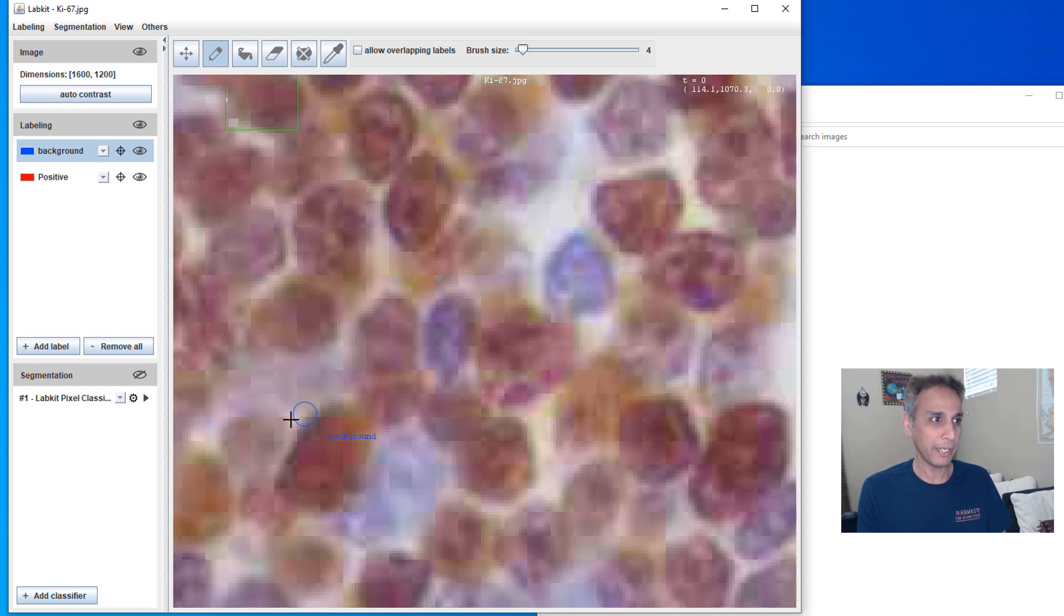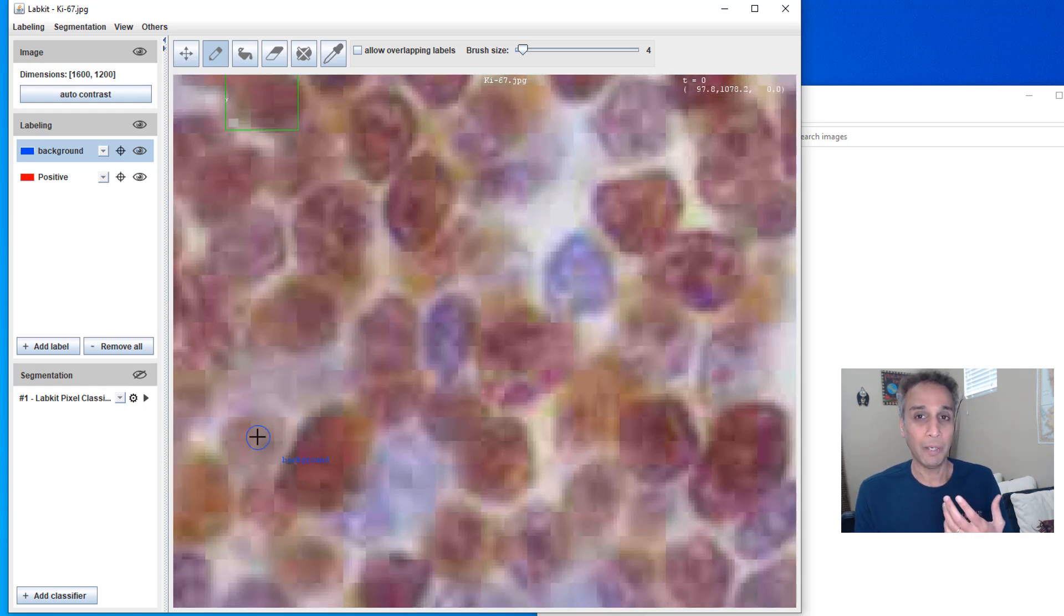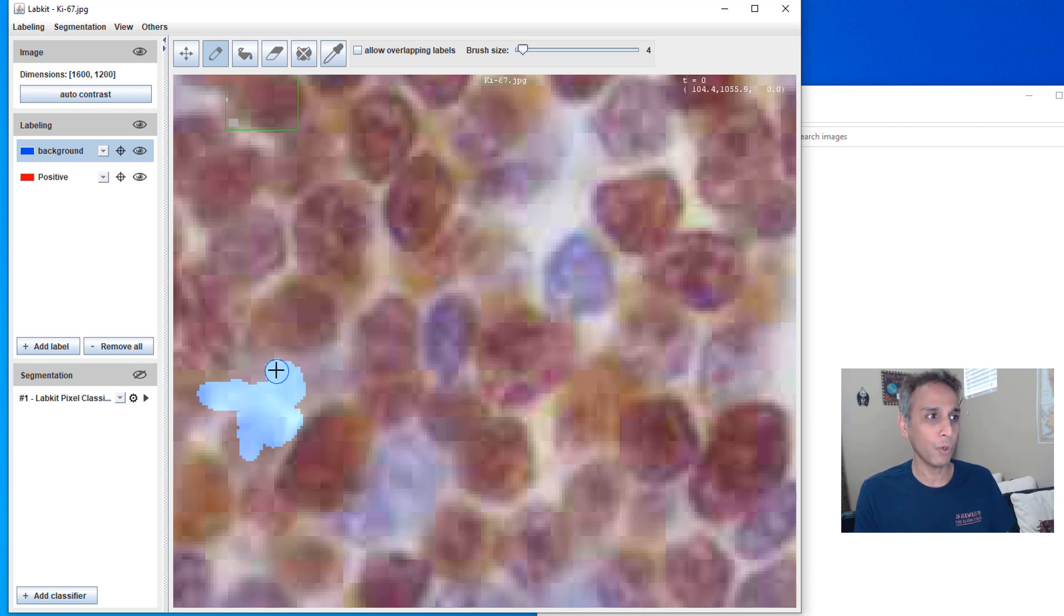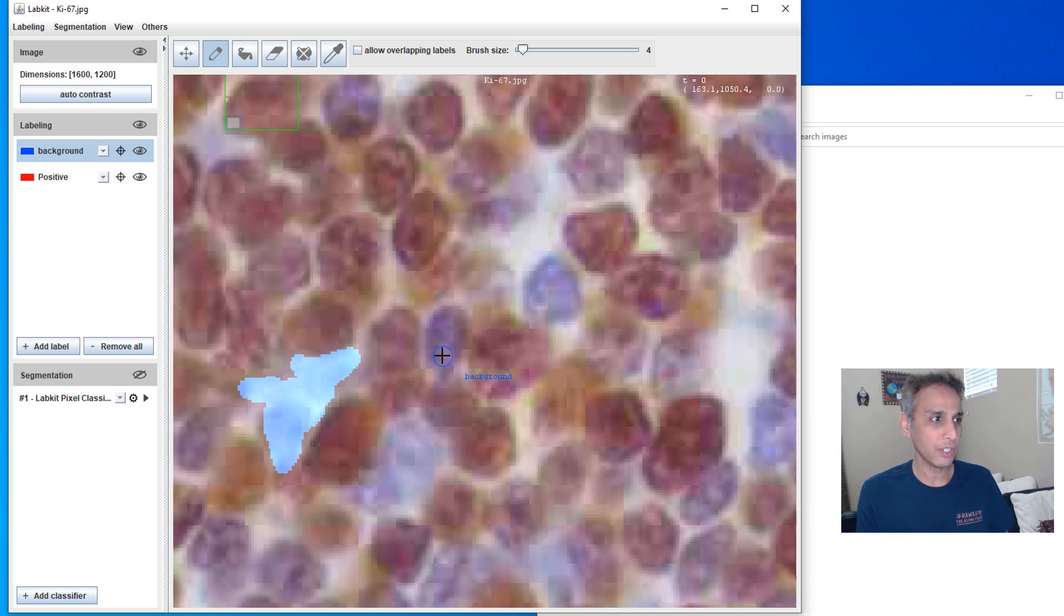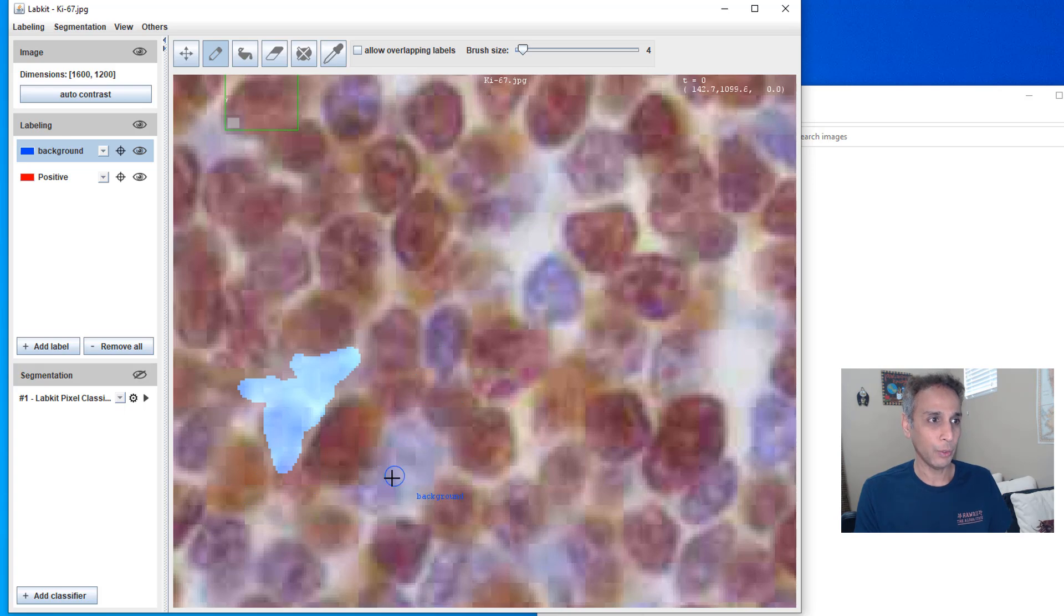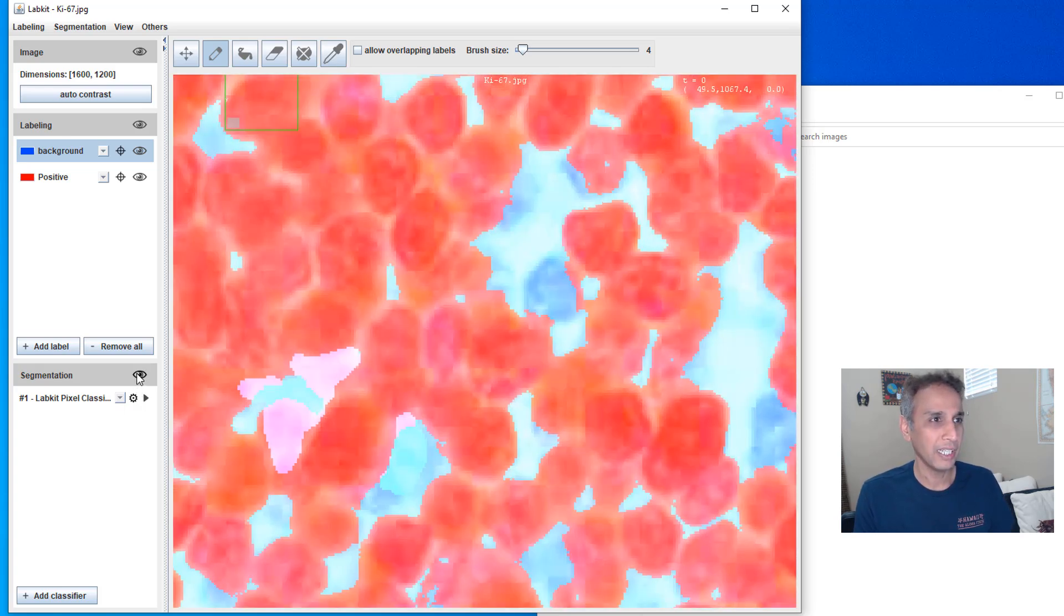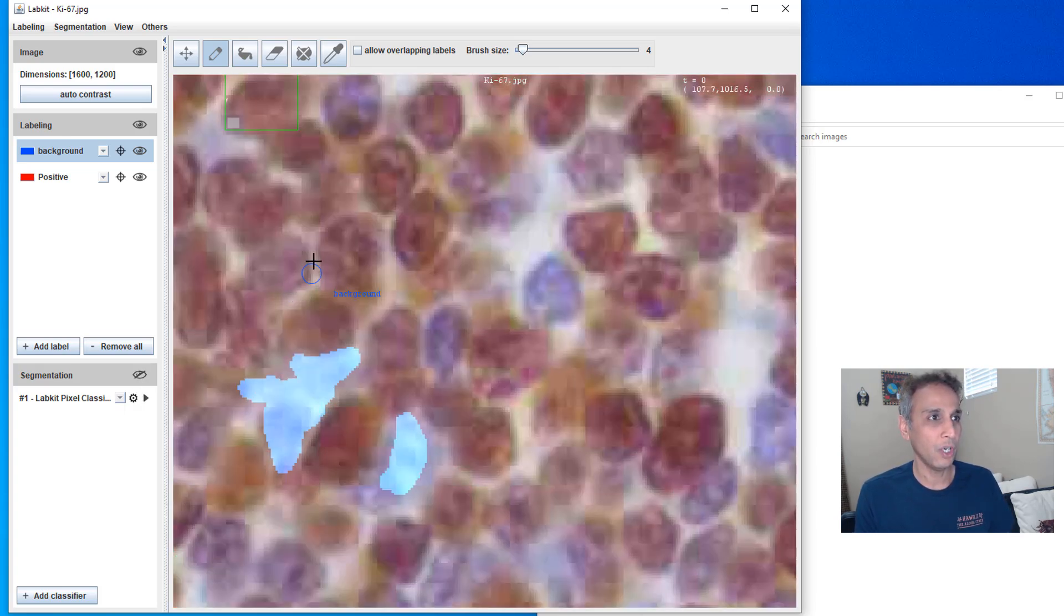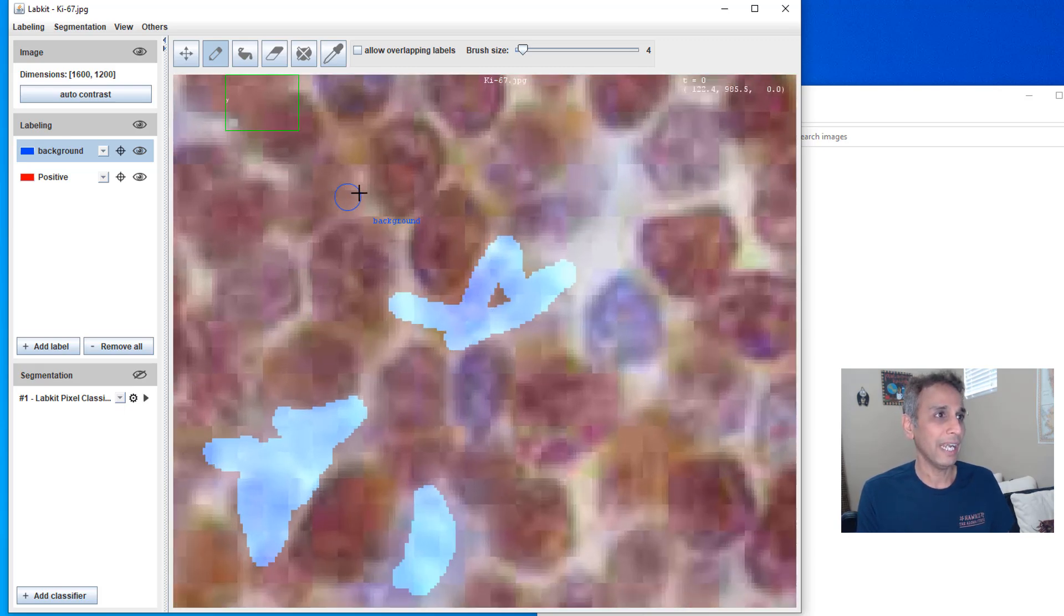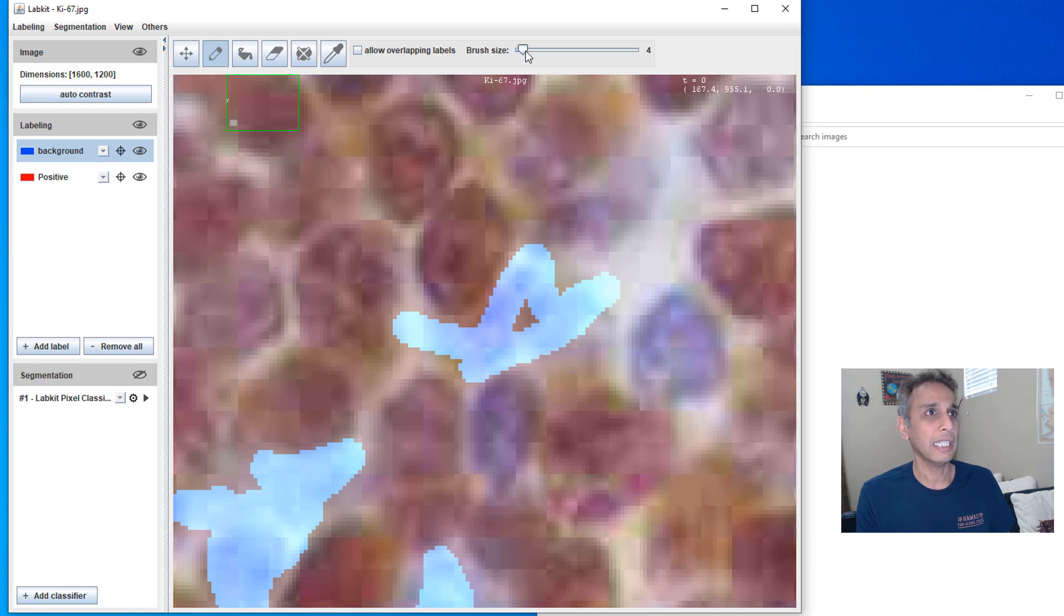But I want to define that as background. So let me go ahead and do that. So I'm going to add more training regions where it is actually failing. So it should be there. And let me turn my segmentation on. All of these regions it's thinking is positive.